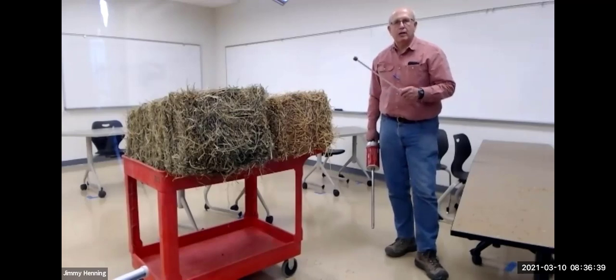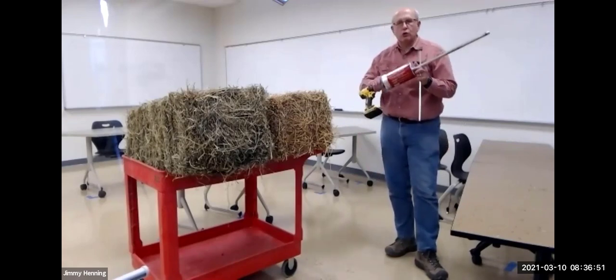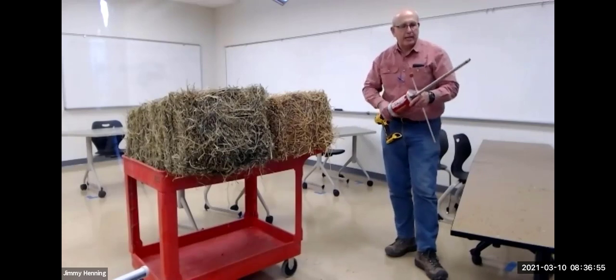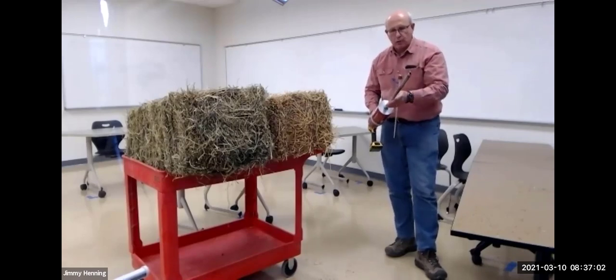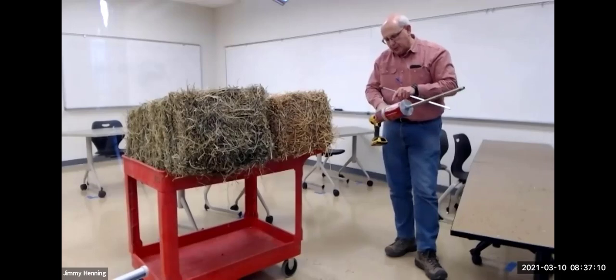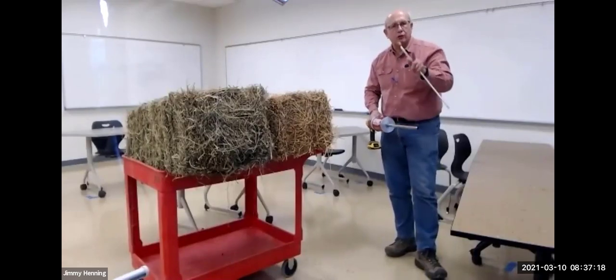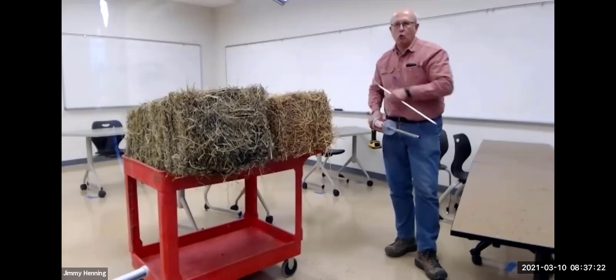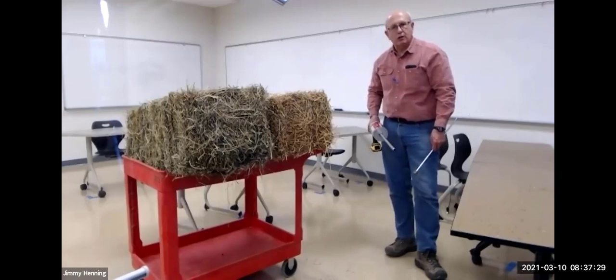You want to pick the right hay for the nutritional needs of your livestock at the time you're going to feed it. I'm going to sample with a core sampler with a battery-powered electric drill attached to it. This sampler has a coring tube, a rod that shoves the sample back into the storage container, and a storage container so I can take 15 or 20 cores, collect them all together, and only empty the canister one time. I'll take three or four cores out of each bale and empty that into a plastic bag to send off for analysis.